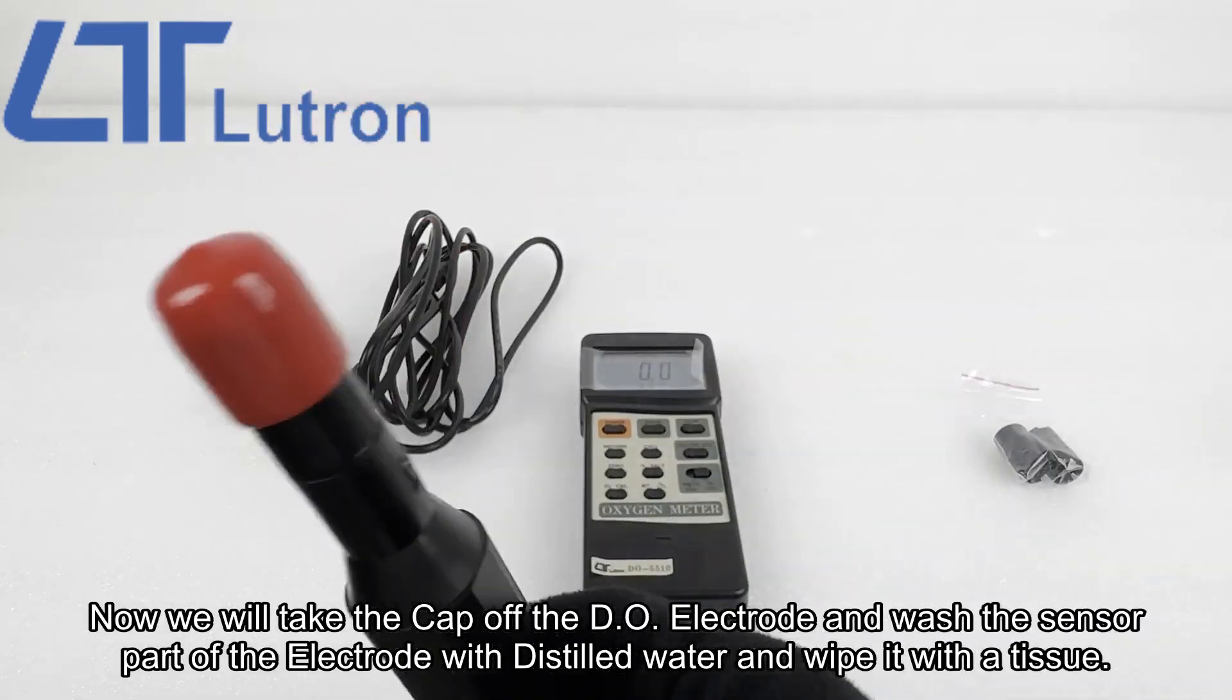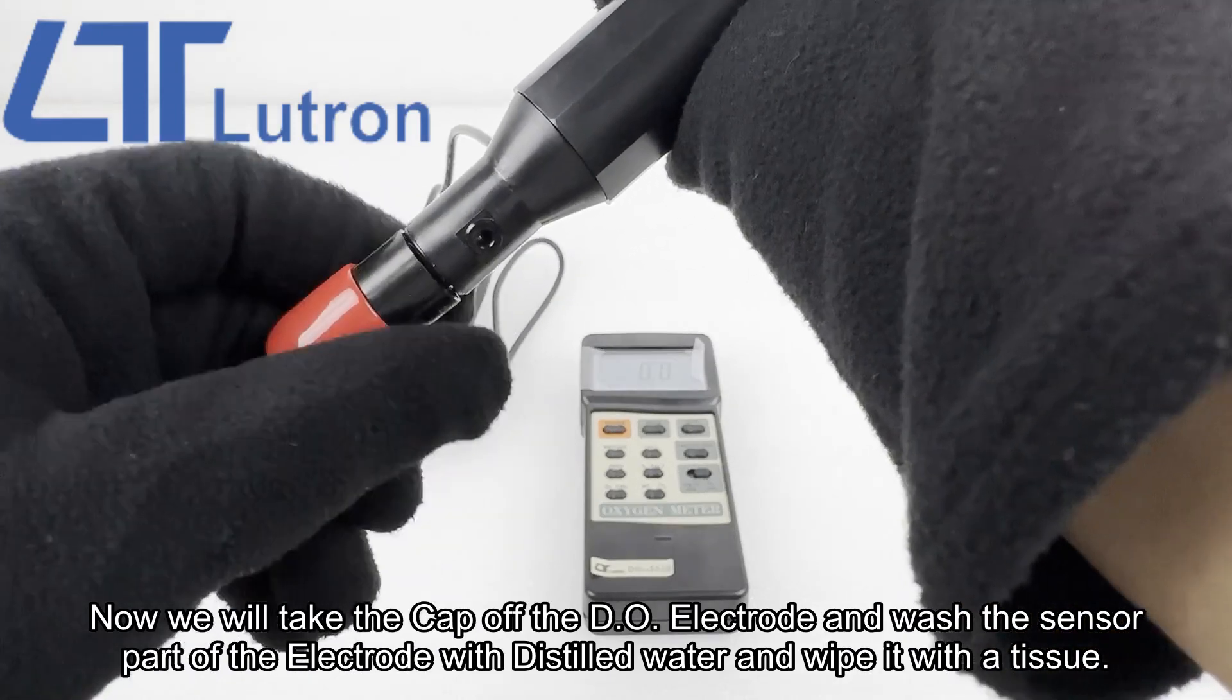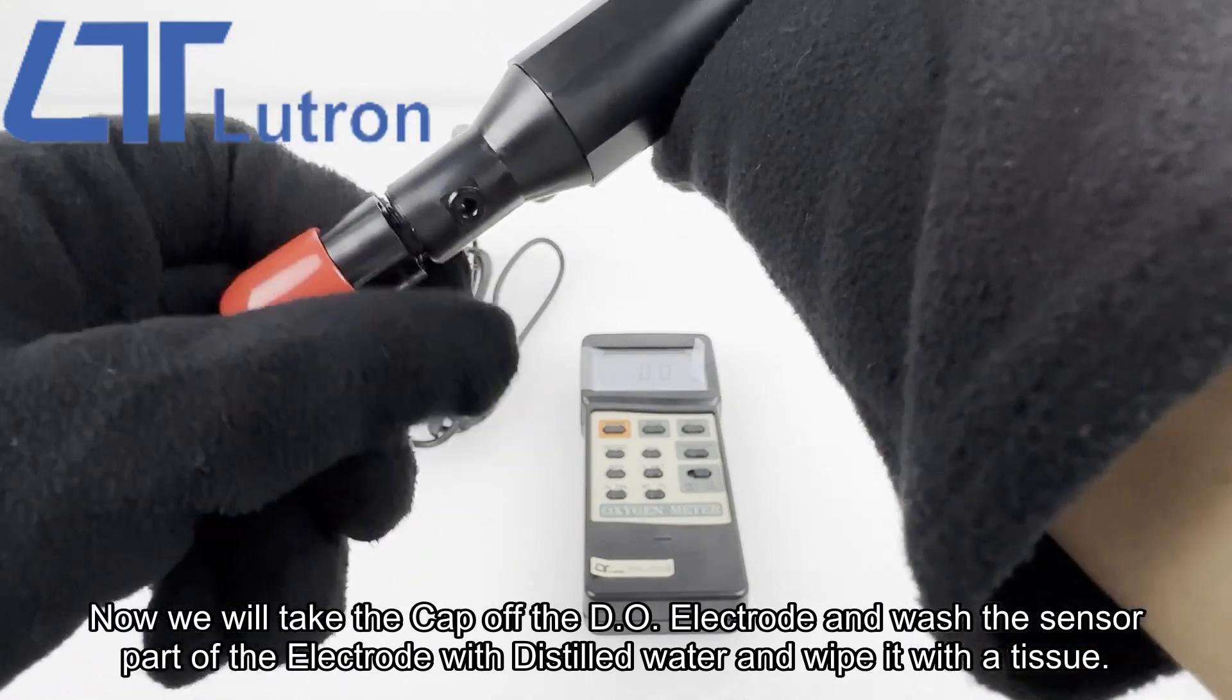Now we will take the cap off the DO electrode and wash the sensor part of the electrode with distilled water and wipe it with a tissue.